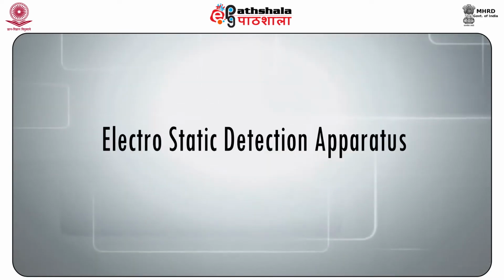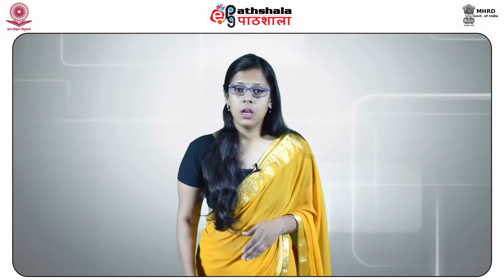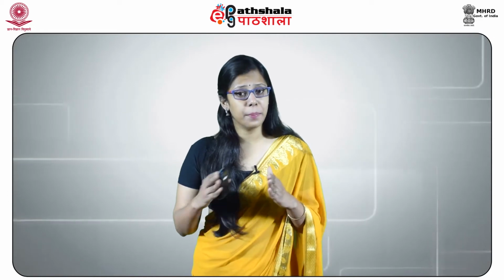Next device in the questioned document field, we have the electrostatic detection apparatus. Electrostatic detection apparatus, which is commonly called ESDA, is a special instrument capable of restoring handwritten impressions in a paper that are completely invisible to the bare eye.